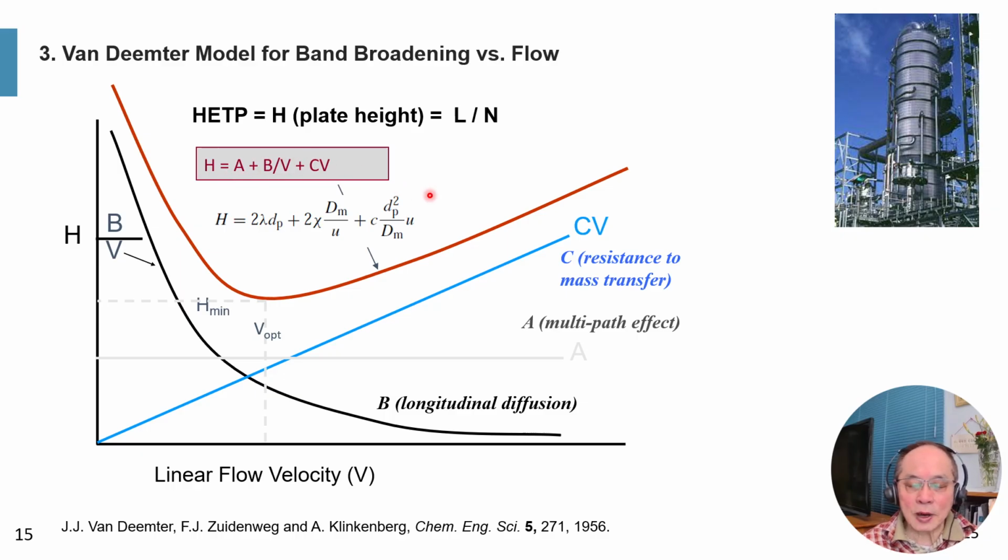Now, the reason why it's being called a plate, or theoretical plate, is the fact that most chemical engineers were designing columns for petrochemical distillation, such as here. These are huge columns, at least 5 stories high, with different plates built inside to fractionate crude oil into different types of kerosene, heating oil, gasoline, aviation fluid, and so on.